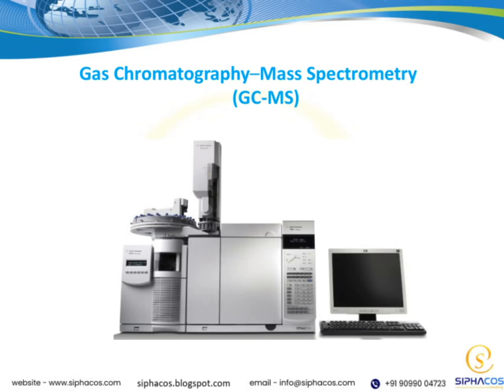Today, I want to introduce you to gas chromatography, mass spectrometry, or GCMS for short. This technique is a powerful analytical tool that combines two methods, gas chromatography and mass spectrometry, to identify and quantify compounds in complex mixtures. Basically, we first separate the components using gas chromatography, which allows us to analyze each compound individually as they pass through a column. Then, as each compound exits the column, the mass spectrometer helps us identify it based on its unique mass-to-charge ratio.